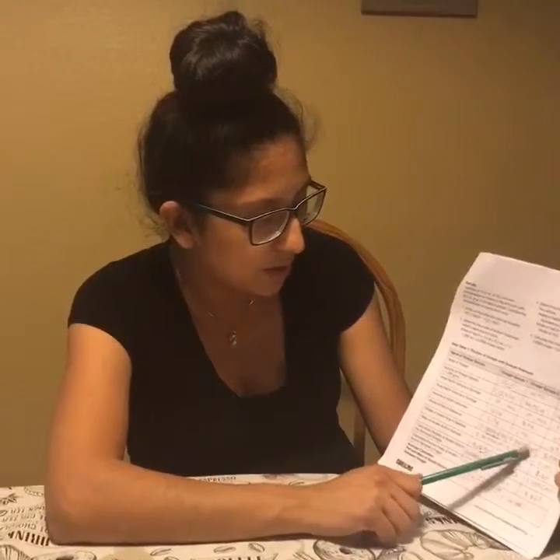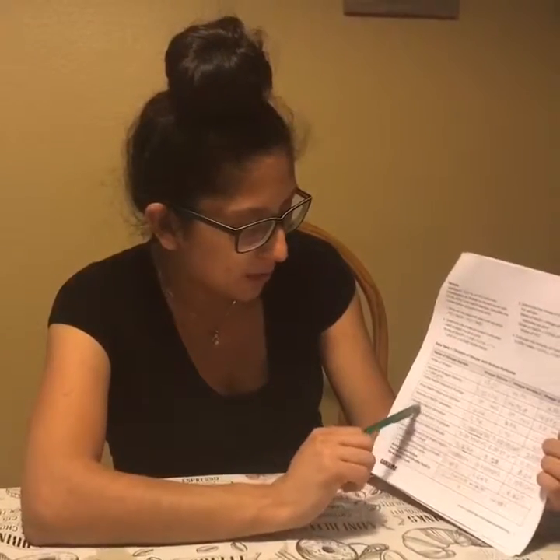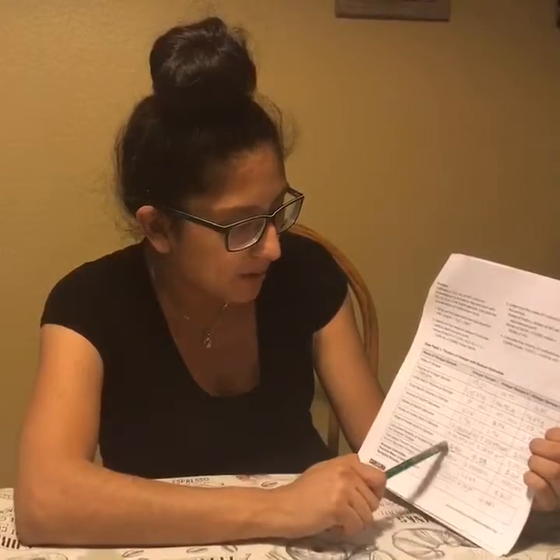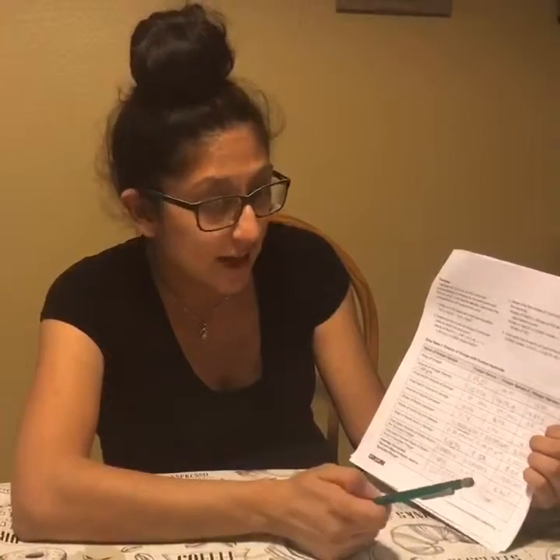The moles delivered also was almost the same. Like I said, just a couple of digits different. The moles of acetic acid in the sample is the same as the moles delivered, so nothing changed there. The mass of the acetic acid in the samples, I think sample 1 and sample 3 had the same, which was 0.24. Sample 2 was 0.23, which is not that much of a difference.